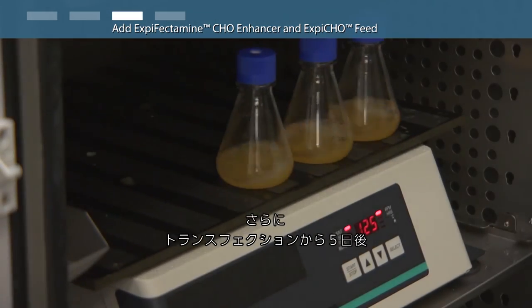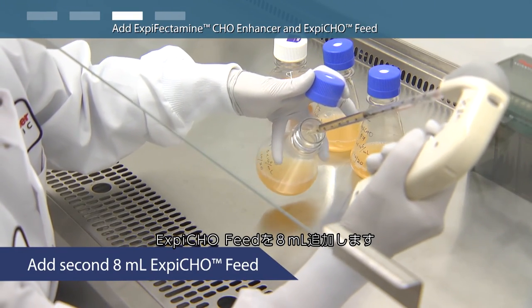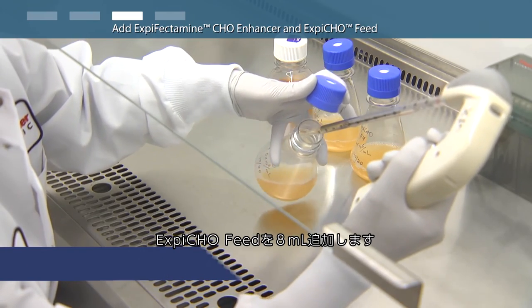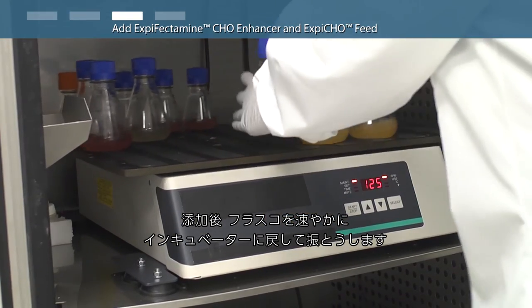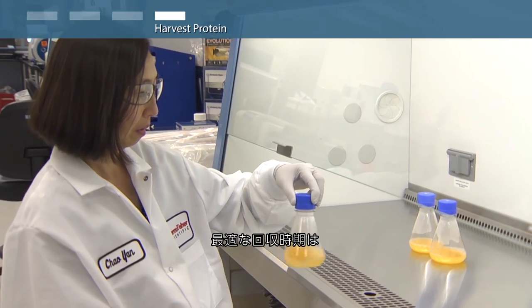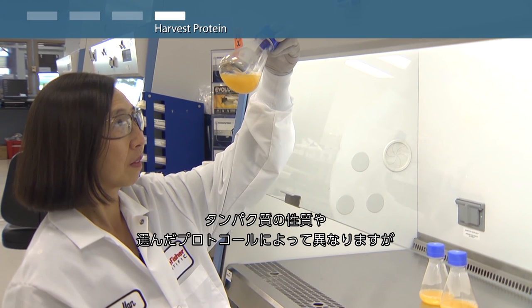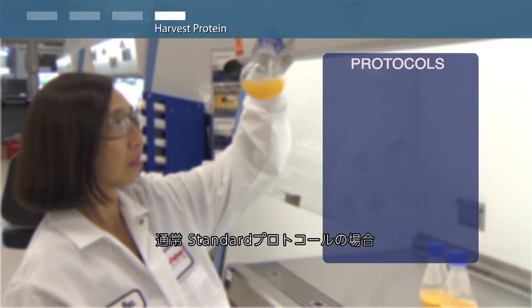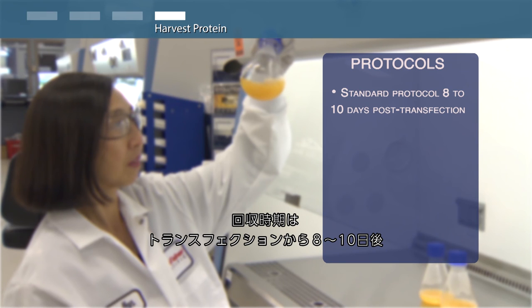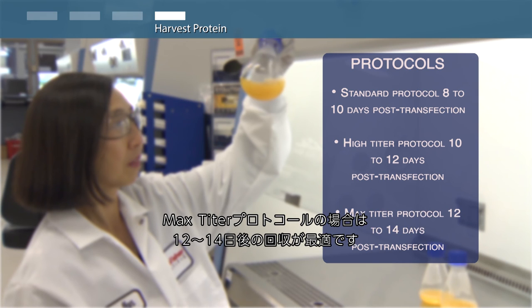For the max titer protocol on day five post-transfection, add the second 8 milliliters of XBCHO feed to each of the 250 milliliter flasks and immediately return the flasks to the 32 degrees Celsius incubator with shaking. Typical harvest times to reach maximum titers are 8 to 10 days post-transfection for the standard protocol, 10 to 12 days for the high titer protocol, and 12 to 14 days for the max titer protocol.